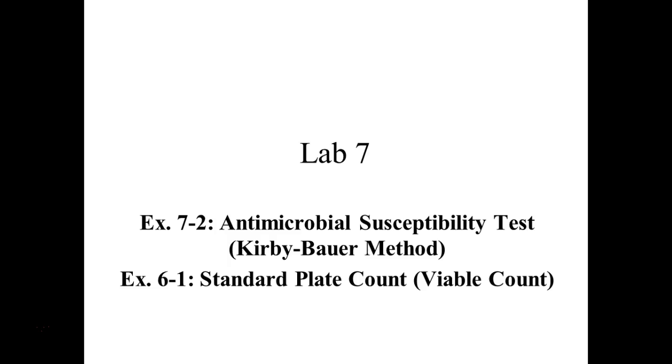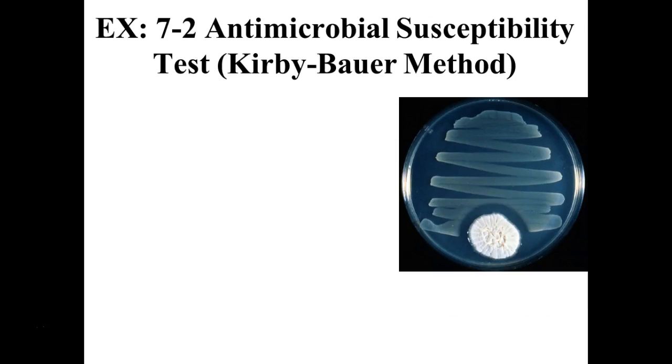We're going to do standard plate count, or pretend to do standard plate count, right? We're going to play around, and we're going to look at the results from the one that I set up. So some important terminology as it relates to antimicrobials.